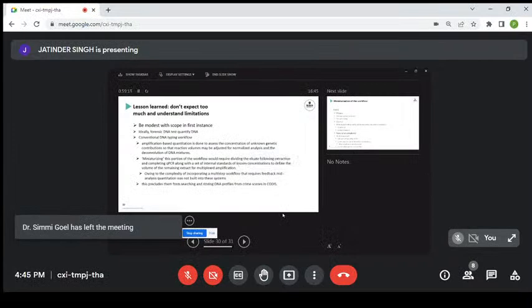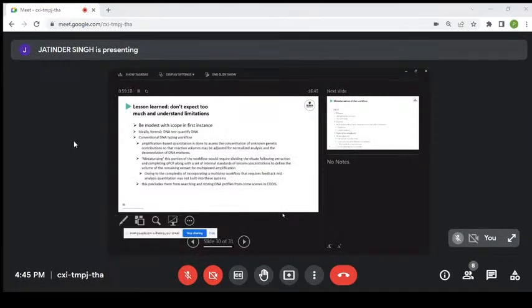So what they realized is that they really had to narrow their scope. There were some requirements for certain uses for legal reasons that would be getting better sales. So to have the PCR amplification quantitative, you need to pre-quantify the DNA before you amplify it to know how much reagent to add. They've let that go. They said, well, we're just not going to meet that now. Maybe we can add that fluidic handling now, but let's first get a system to the market. We're not going to be able to solve all problems in one go.